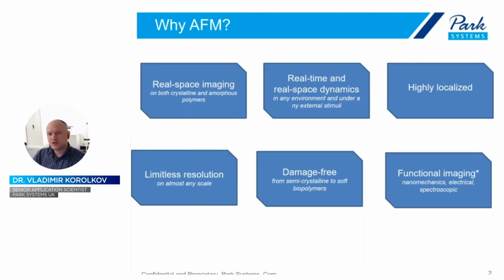And apart from structural imaging, the fundamental advantage of that technique is that you can always measure some property. You can do what we call functional imaging. So you can access things like nanomechanics. You can probe whether your surface or your sample is stiff or soft. You can probe electrical properties. You can see whether your sample is conductive, and you can measure that conductivity. So you can measure the current or resistivity of the sample, and again, on an extremely small scale. You can also look at piezoelectric materials, and you can measure piezoelectric response from these materials. And as Justina mentioned, we will cover all these topics in the upcoming webinars.